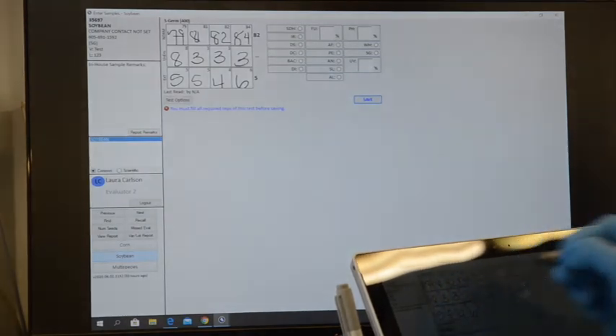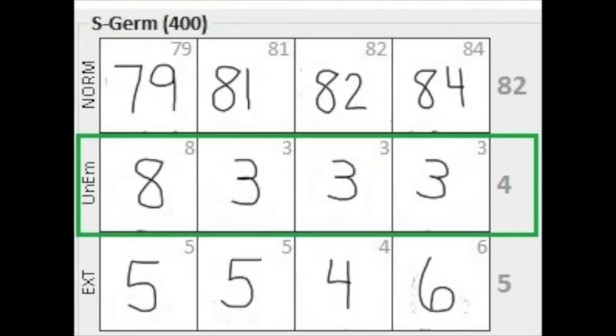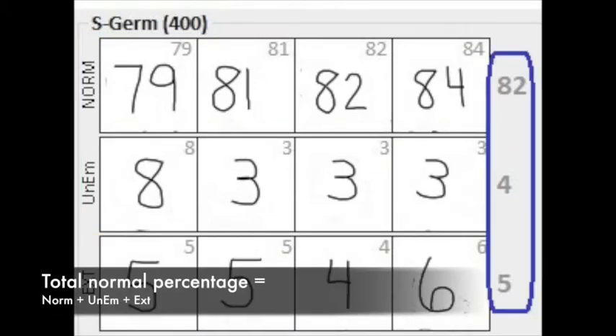This is the screen that we document our normals on. Notice we have a normal column, an unemerged column, and an extended column. When you add all three of these up, that's going to give you your total normal percentage.